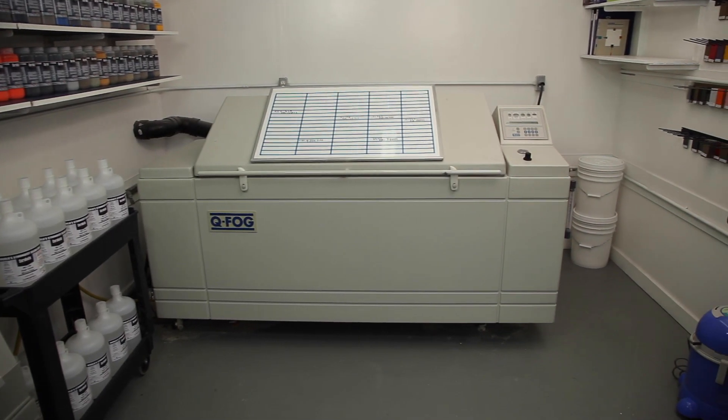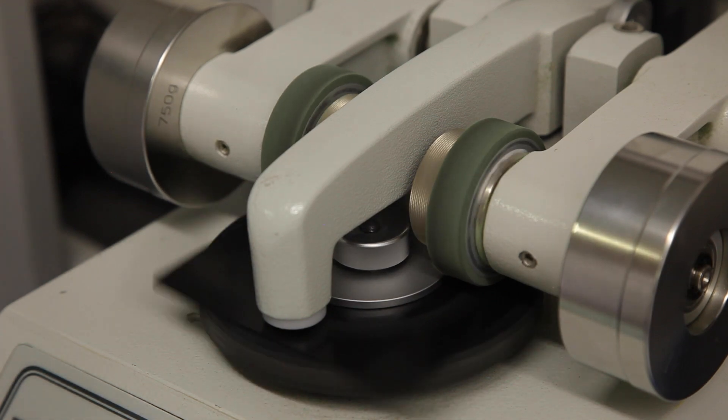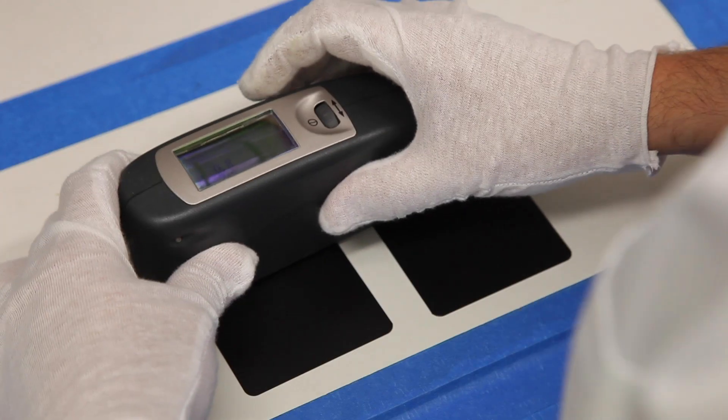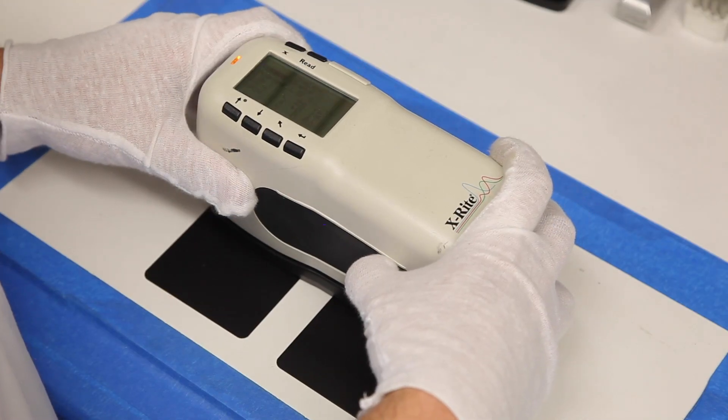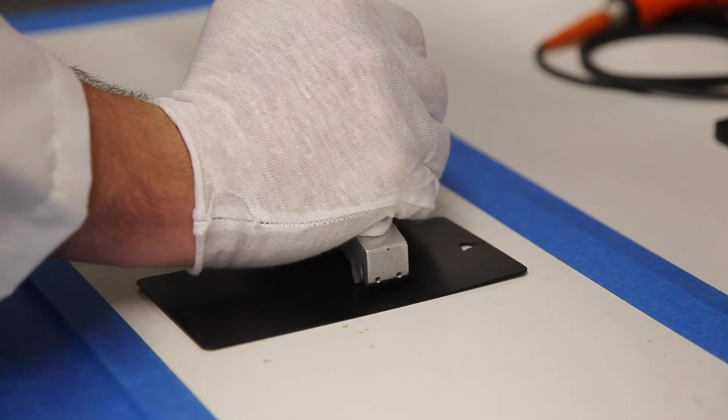NIC tests are in accordance with ASTM standards. ASTM International is a globally recognized leader in the development of standards used around the world to improve product quality, safety, and consumer confidence.